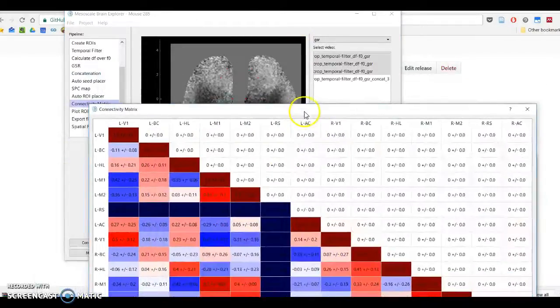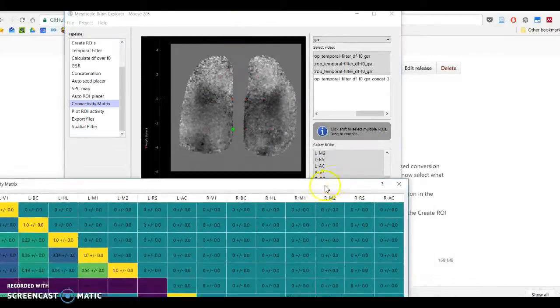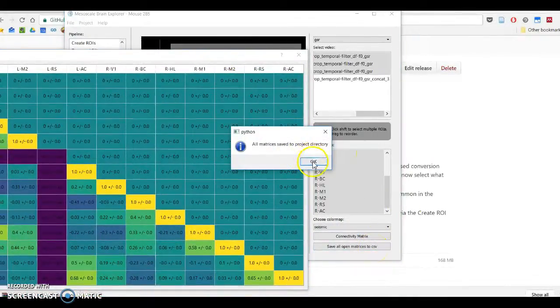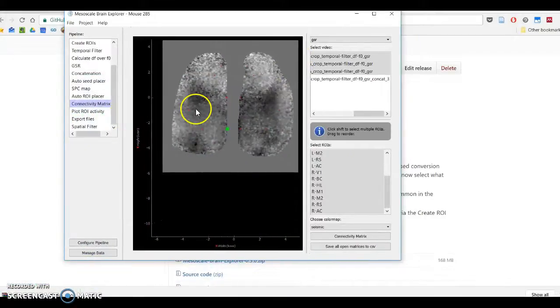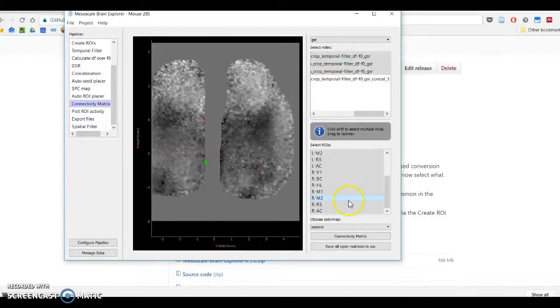So next, you might be asking, okay, so what is the standard deviation? What do these values actually mean? If I quit these, I shall quickly save this matrix to file. I'll show you that in a second. So what did those standard deviations mean? I selected these 3 files, which of course created a matrix out of all of these.